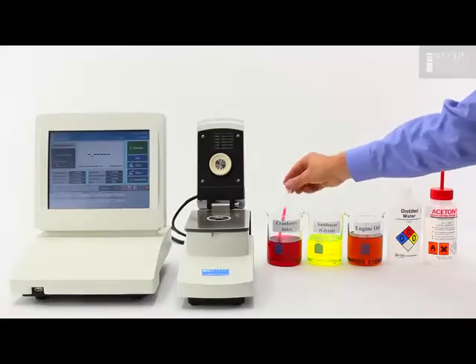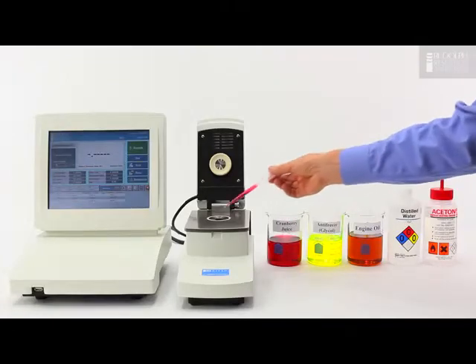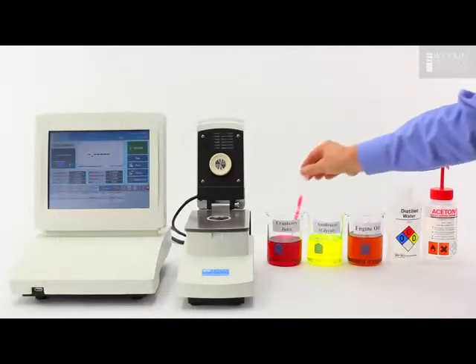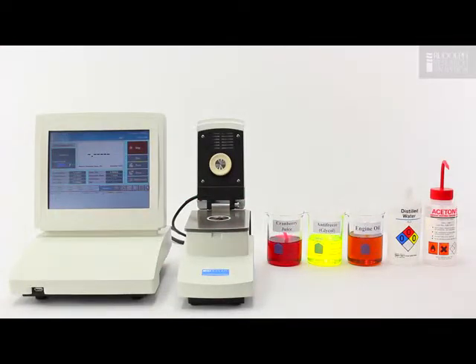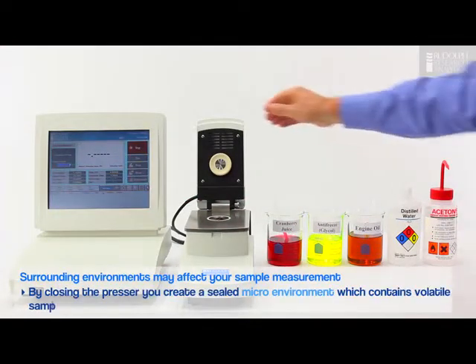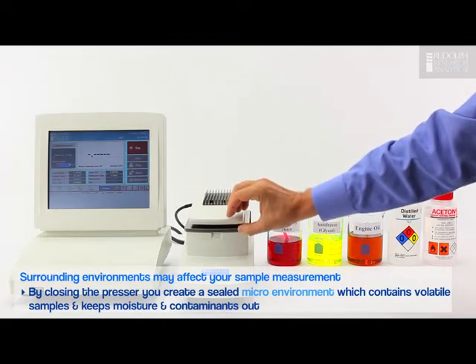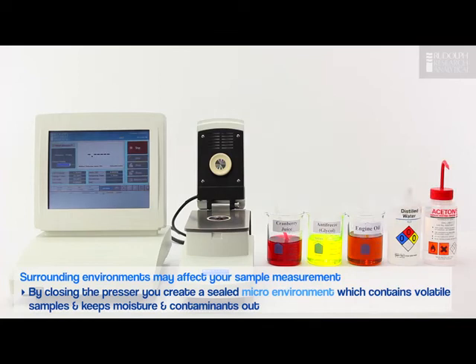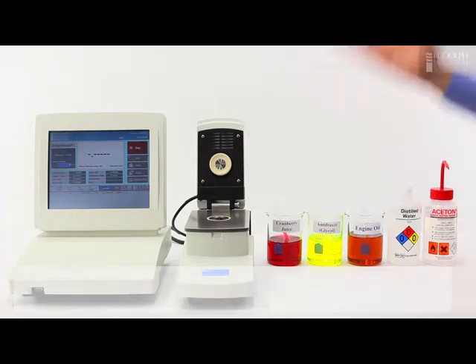Our next sample is cranberry juice. Once again I just repeat the process and place some cranberry juice on the prism and wait for the instrument to measure. If I wanted to I could also close the lid. This is very important if the sample is highly evaporative. For a material like cranberry juice measured at 20 degrees C, the evaporation is not very high and so I can just leave the lid open.